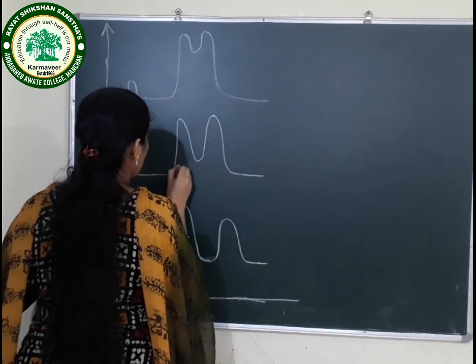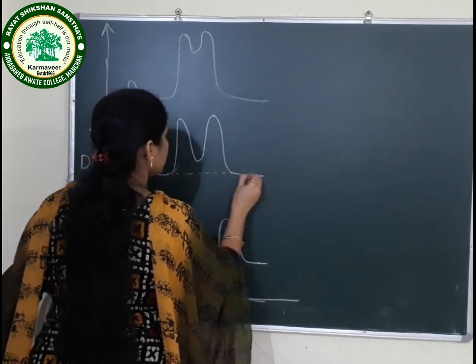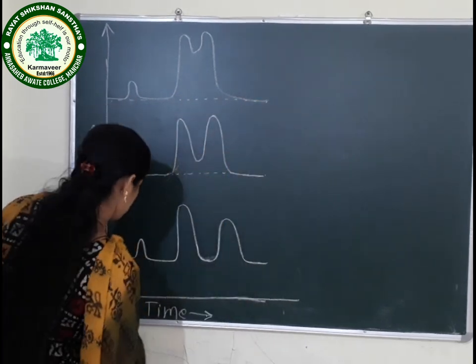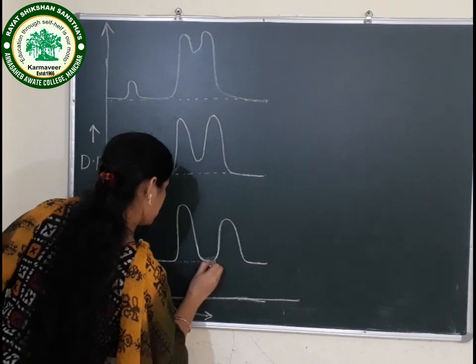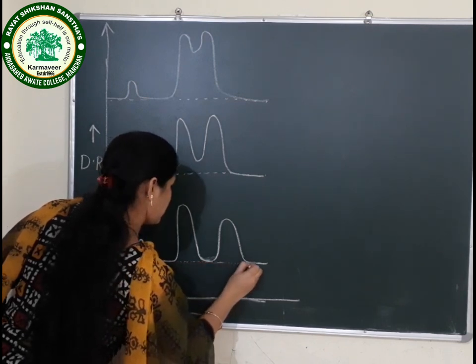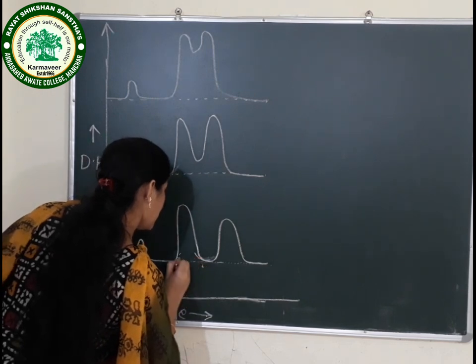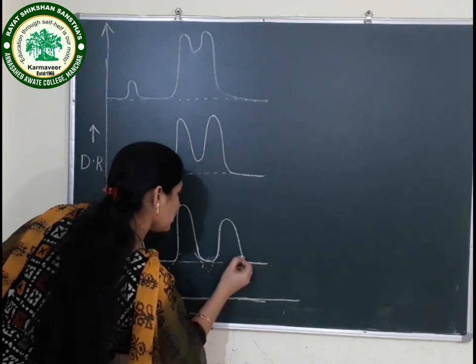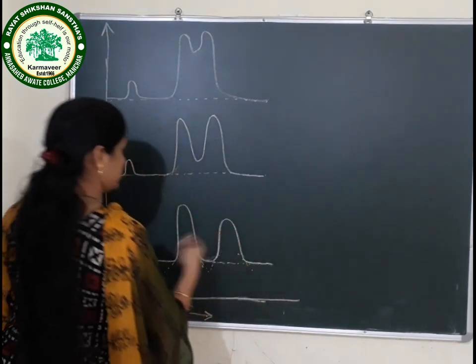Now we will draw the baseline for each graph. This baseline is drawn on the tangent. Okay, firstly you have to draw the tangent, then draw this baseline.